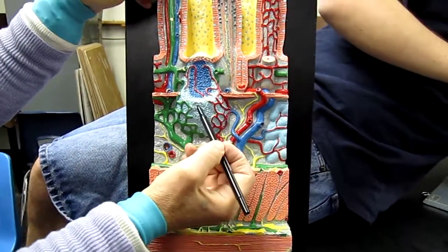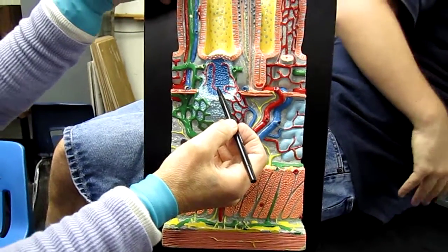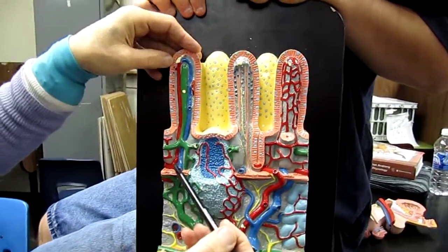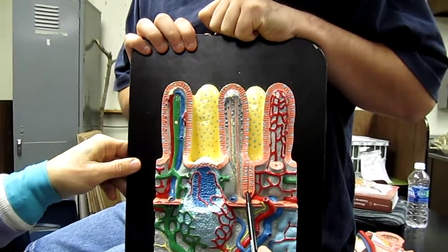Okay, notice that this coloring is wrong. For a germinal center, it should be light colored on the inside and dark colored on the outside. And then here we have the villi, okay? And between the villi is the crypts of Lieberkühn.